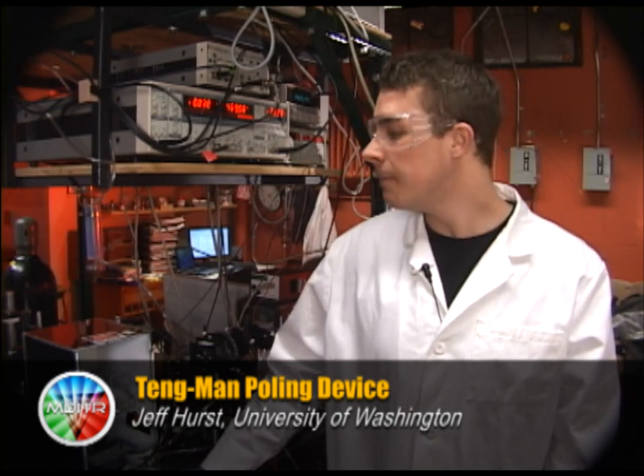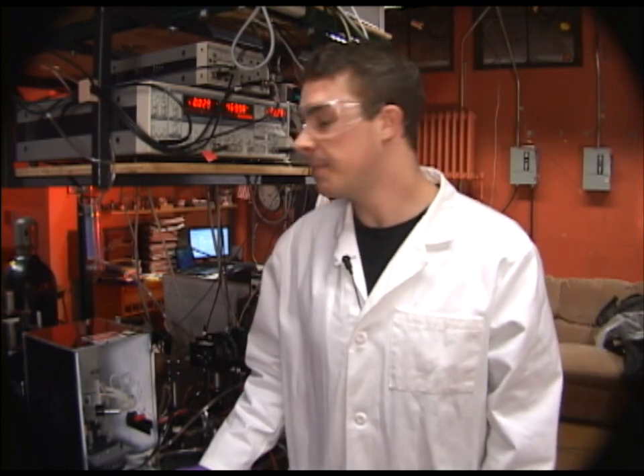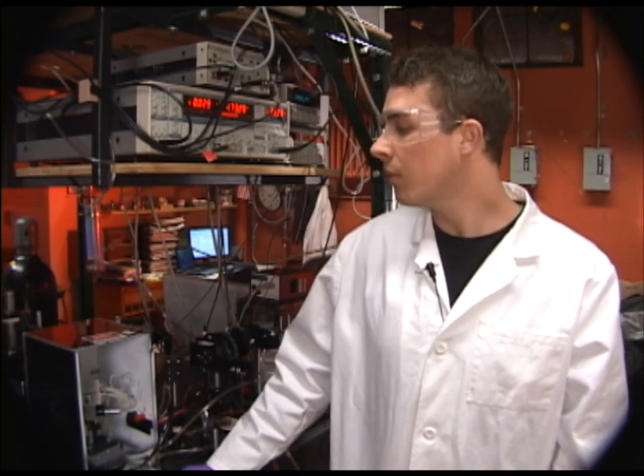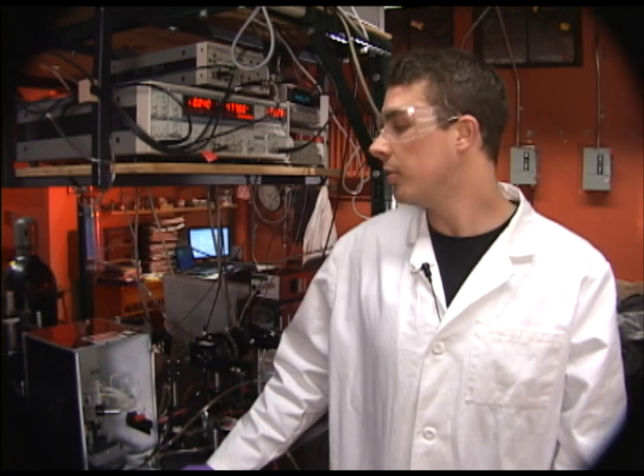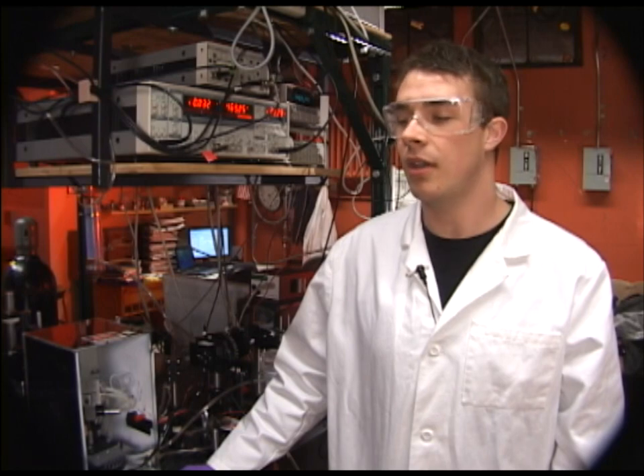Hi, I'm Jeff Hurst. I'm an undergraduate working for Dalton Research Group at University of Washington, and this is a Teng-Man in-situ poling device. Teng-Man is an ellipsometric technique to measure the electro-optic coefficient known as R33. Poling is a process to induce order in host polymer chromophore materials, and in-situ means that we can monitor electric, optic, and thermal data all in real time.